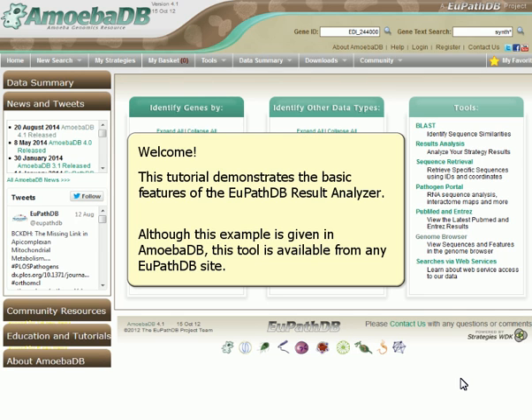Welcome. This tutorial demonstrates the basic features of the UPathDB Result Analyzer. Although this example is given in AmoebaDB, this tool is available from any UPathDB site.